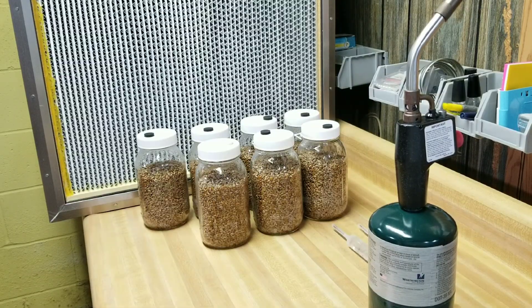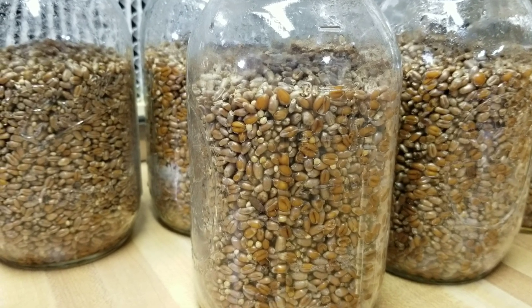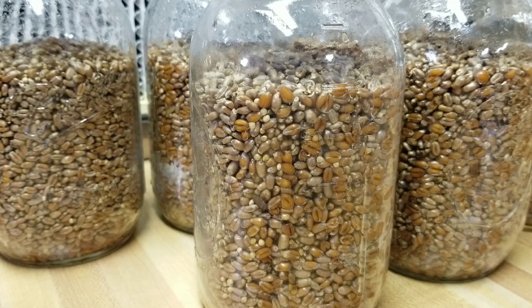Welcome back guys, it's the next day. Got the flow hood running, I'm masked up, gloved up, and ready to inoculate our grain jars. We're doing three with agar wedges today - I just got a new culture on agar that I'm excited to try - and the other four with liquid culture. I'll show you guys a close-up of these jars so you know what to expect when you pull them out of the pressure cooker. The grain has settled quite a bit - it was sitting much higher and more loosely packed when I put it in.